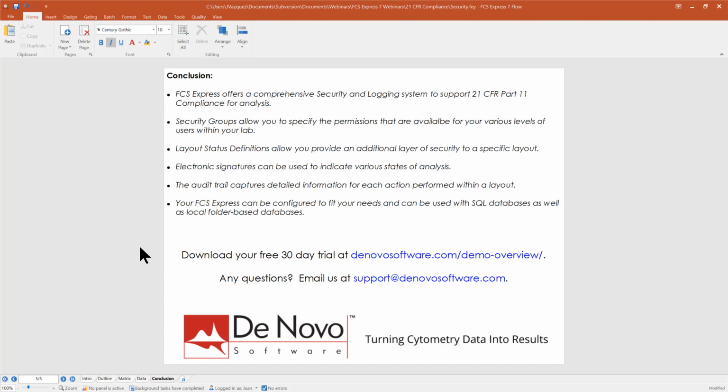Basically, I just want to wrap up this webinar by saying that FCS Express offers a comprehensive security and logging system to support 21 CFR Part 11 compliance for your analytical needs. The ability to use security groups does give you the ability to provide and specify which permissions are available for the various members of your lab or of your institution. And it's a great way to manage who can do what and determine what kind of control the various users have within your lab.